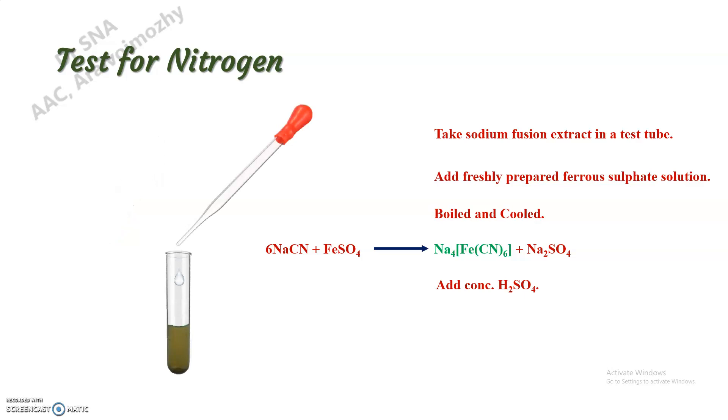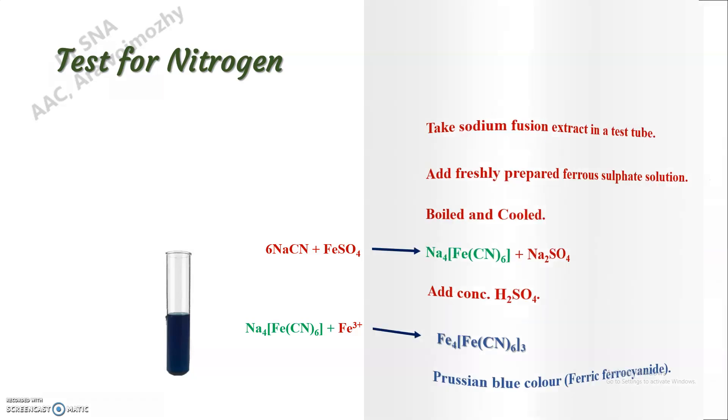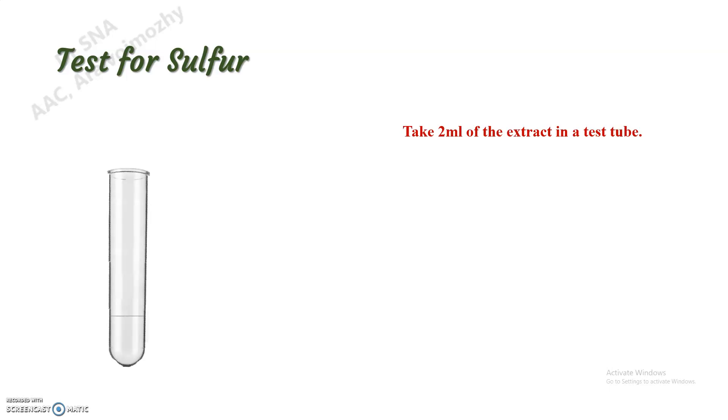We can see the formation of Prussian blue color. That is due to the formation of ferric ferrocyanide complex, which indicates the presence of nitrogen. Next, the test for sulfur. Take a small amount of extract in a test tube.